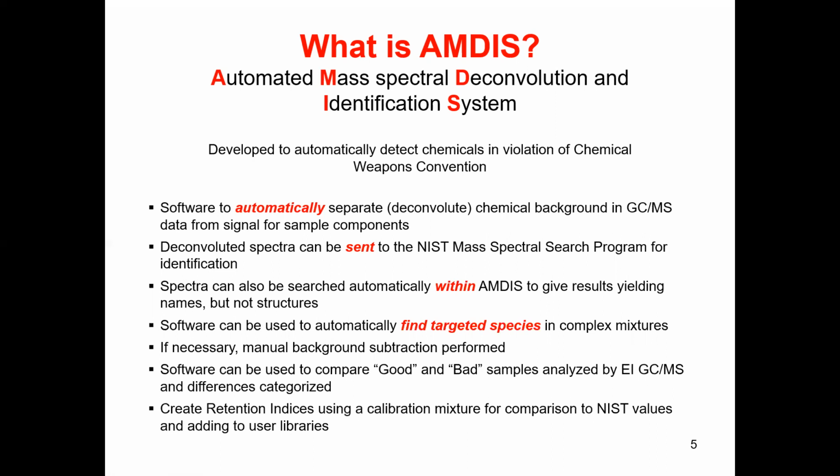You can create retention indices using a calibration mixture for comparison to NIST values, because they can do a lot of searching or limiting of the search by retention indices, but AMDIS is what they use to calibrate your spectrum to attain the retention indices that you can use within the NIST search.